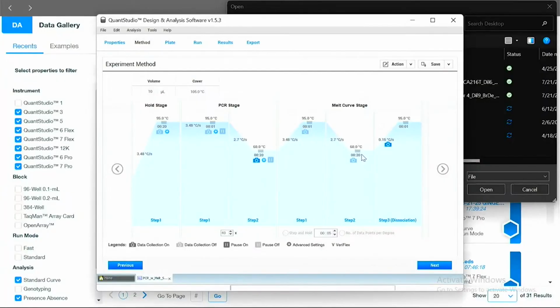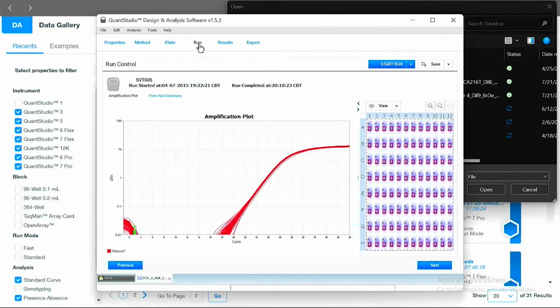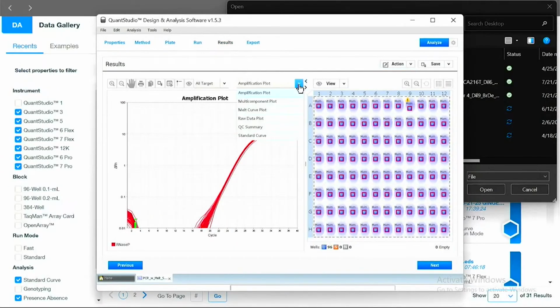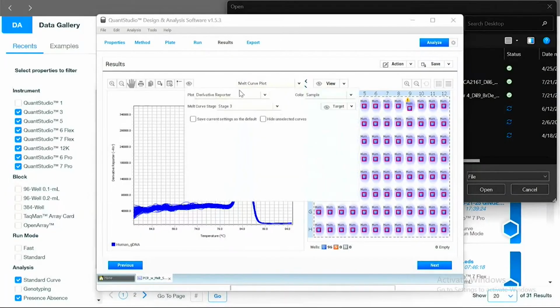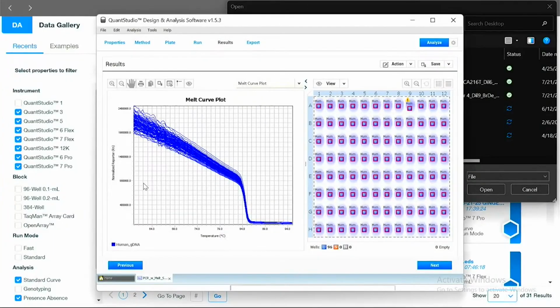We will eventually get to the point where everything falls apart in a big reaction. So it's going to be a slow decrease over time, and then eventually we get to this point where it kind of just gives up and says, forget it, I'm going to fall apart. We call that the melting temperature. It's where that happens in a big way. So we can look at this melt curve plot. This is what people put in papers and look at regularly, but you can look at it instead of in this derivative plot, in the normalized plot, which is what I just walked through conceptually.